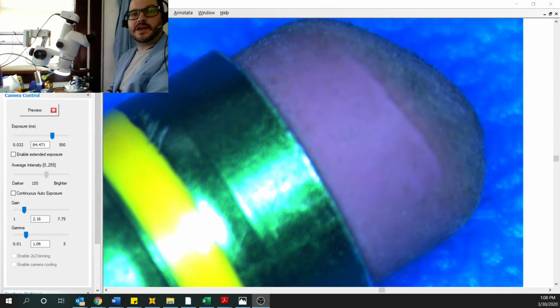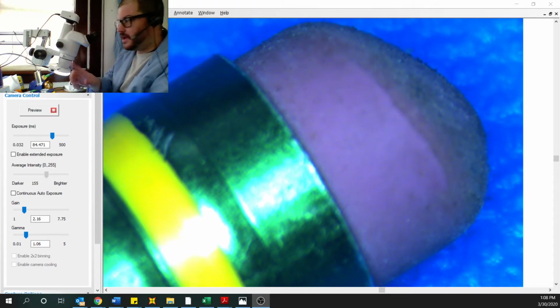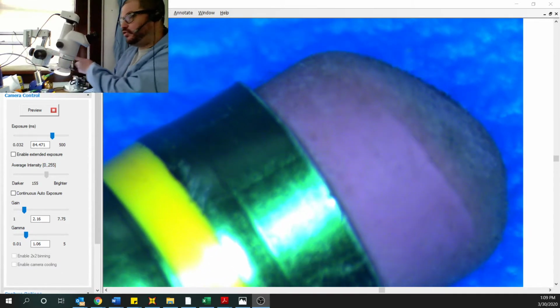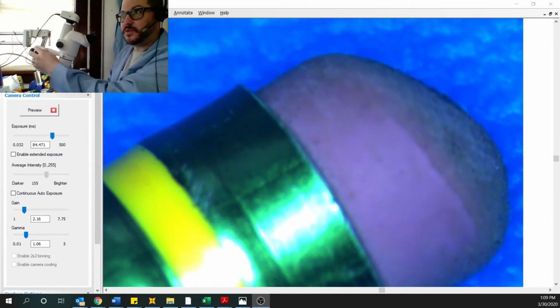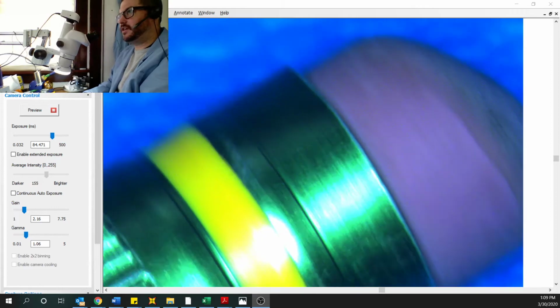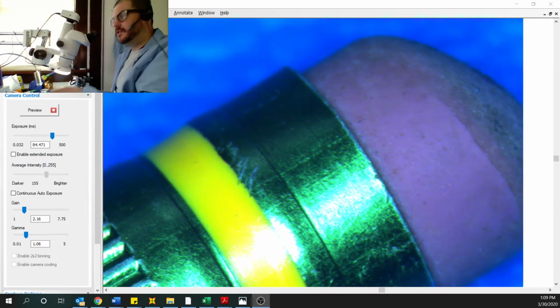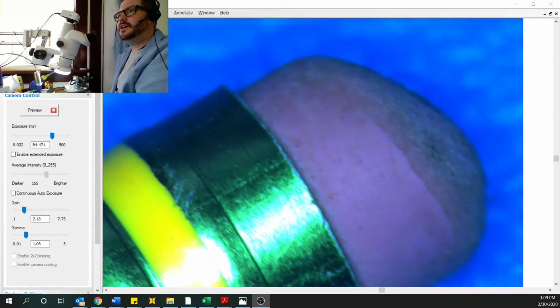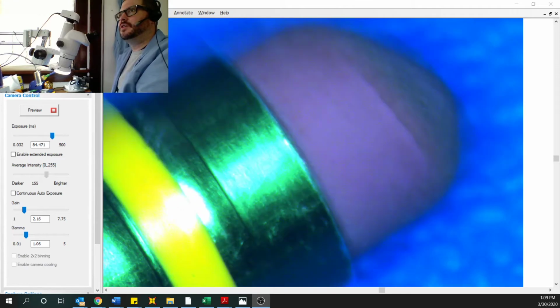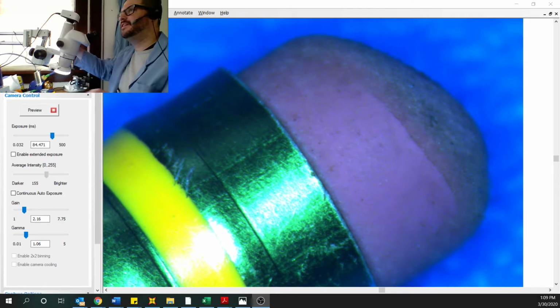That's at 20x magnification, but it looks a little bit blurry, right? I need to use my focus knob here, which I actually have two of, one on each side of the microscope, and I use the focus knob for making the microscope go up and down slightly. I'm going to hold the pencil still. There you go. And look at that. Look what the eraser looks like. You see that? There's all kinds of little things there. Look at that. Isn't that neat?